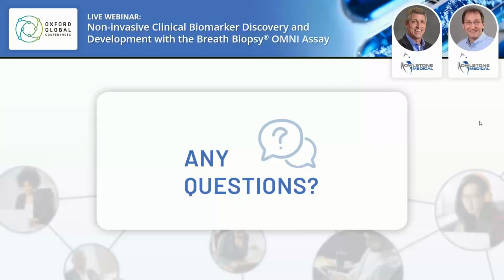Thank you. If a sample is thought to be contaminated with exogenous VOCs, is it possible to extract and clean the data to remove these? Very likely not. I guess you could, if you knew what exactly the background levels were, if you had taken a background sample that had the contaminants in it, potentially you could do a subtraction of the data, but theoretical versus practical are two different things. So I'm not sure on that one.